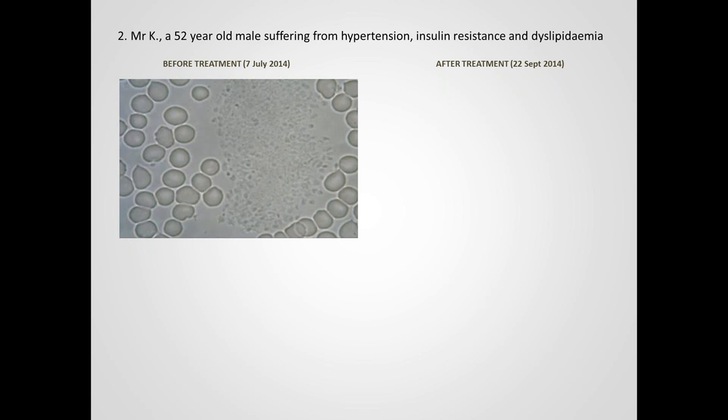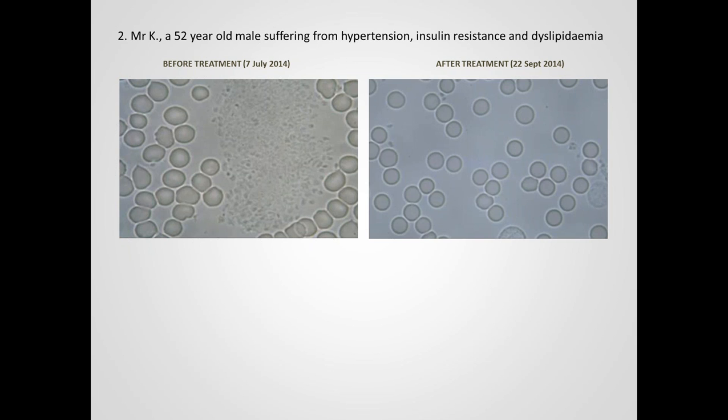Thrombocyte aggregation is a very important risk factor in cardiovascular conditions, and there have been several books written where it's highlighted as a major indicator for cardiovascular disease risk. And usually when we encounter these groups of thrombocytes, we compare the group to the size of the red blood cells, and you can see the size of this group is really enormous compared to the red blood cells. So this is really a very high-grade finding that we found with this particular patient.